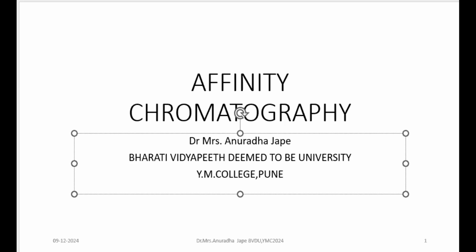So wherever there is affinity for a specific molecule, these molecules having affinity for each other will interact through non-covalent binding, right? So the capacity of the biomolecules for specific non-covalent binding, that is reversible binding, we have to learn and use in affinity chromatography.